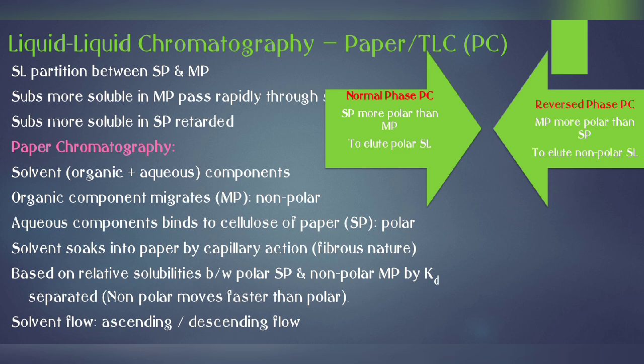One of the best examples of liquid-liquid chromatography is paper chromatography. Here we are using a solvent which contains an organic and an aqueous phase.